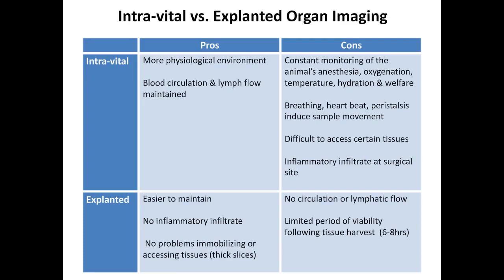Also, some tissues can be difficult to access and can require more complicated surgery. And the surgery can cause an inflammatory infiltrate, mainly neutrophils, at that surgical site, which could change the behavior of the cells that you're trying to image.